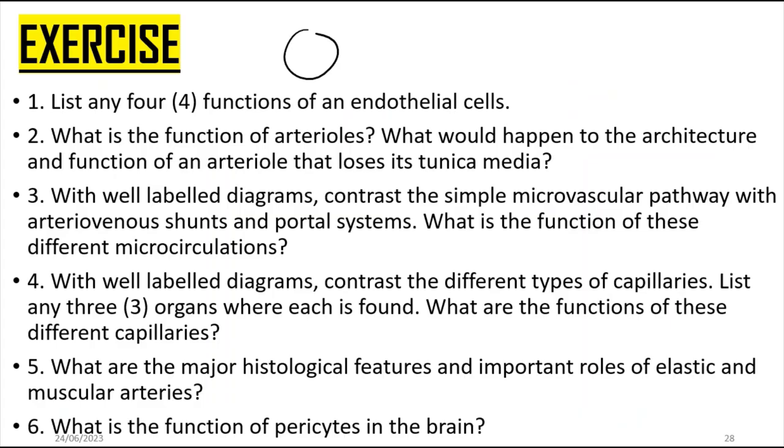So now, that was the last histological slide. After you draw all of those slides, then you do the exercises. Number one, list any four functions of the endothelial cells. We know endothelial cells are simple squamous cells that are found in the tunica intima. Number two, what is the function of the arterioles? What would happen to the architecture and function of an arteriole that loses the tunica media?